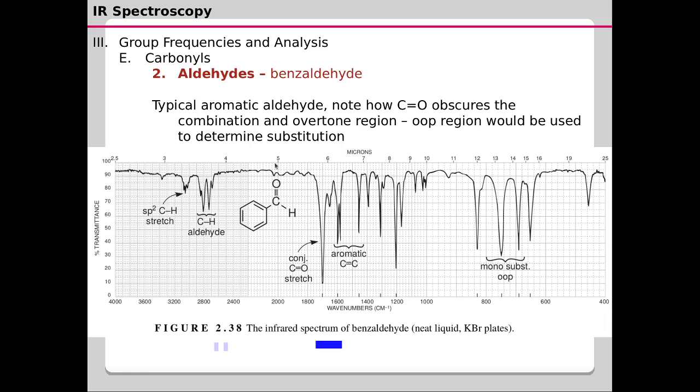And as for the phenyl functional group, you can see the asymmetric stretching vibrations of the aromatic C=C bonds of the phenyl ring between a region of 1400 centimeter inverse and 1600 centimeter inverse. So these are signature bands for the phenyl ring system here. Whereas for the cyclohexane ring system that we have seen in the previous spectrum, we didn't see such kind of bands.